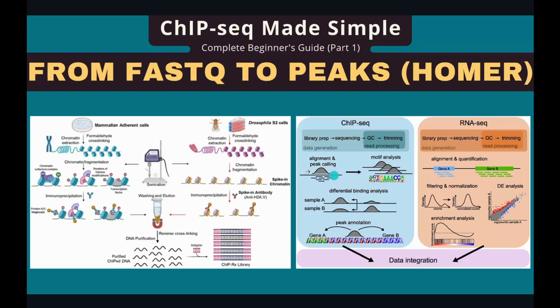How does it work? First, we cross-link proteins and DNA in the cells. That means we fix the interaction between proteins and DNA. Next, we lyse the cells and fragment the DNA-protein complex. In the next step, we introduce antibodies that bind to the proteins of interest. This is the core step of ChIP-seq.